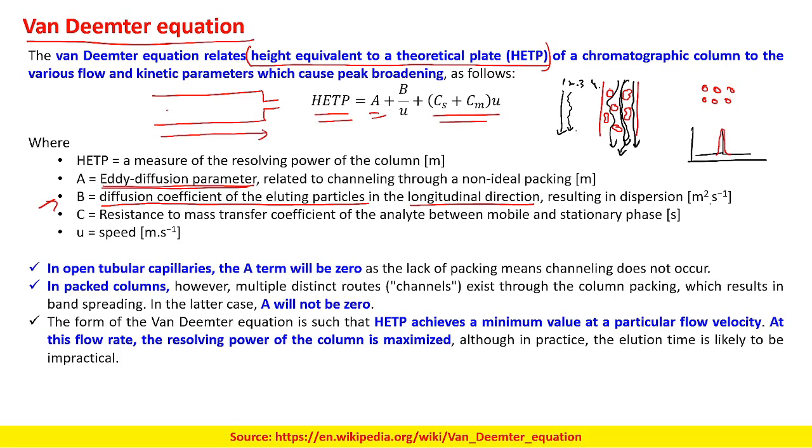Okay, now we are expecting that it will move in the same front. Okay, so from this way we are having this mobile phase which is moving this solvent front or the analyte.